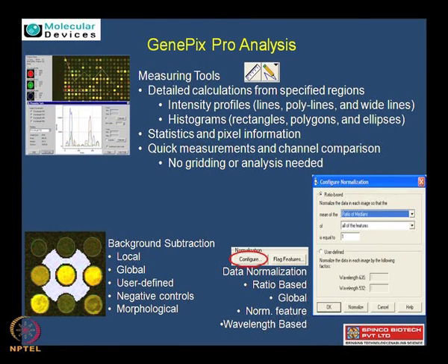Sure. So in the result tab, what you immediately see is a window which lets you configure different types of normalizations. There are different kinds of background subtraction one can perform. As you see in the image, if this is my spot in yellow, which has a periphery ending in black, the surrounding areas, surrounded by white, can be used to calculate the local background correction. So the local background is immediately near the feature, in an area which should not have any fluorescence, and whatever comes in is just because of the background. That is called the local background.